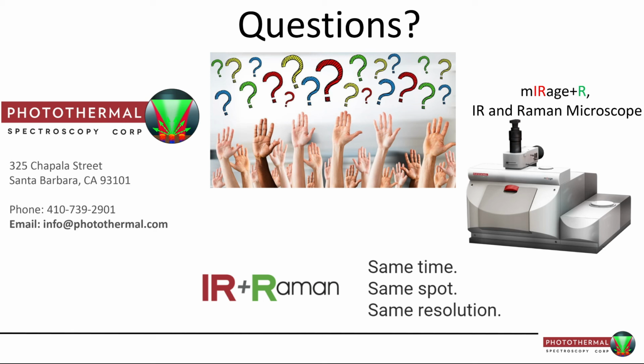And it's one of the strengths of O-PTIR that it doesn't matter the thickness of the sample, whether it's 2 microns, 2 millimeters or 10 millimeters, smooth or rough, the spectra you get back in reflection mode look like FTIR transmission mode data, which means they are fully compatible with all of the libraries that have been used for 30, 40 years.